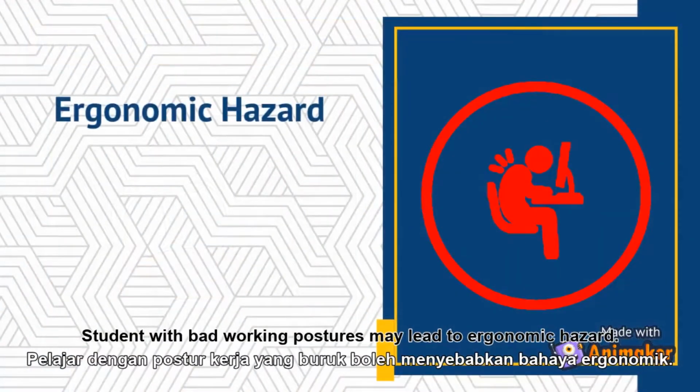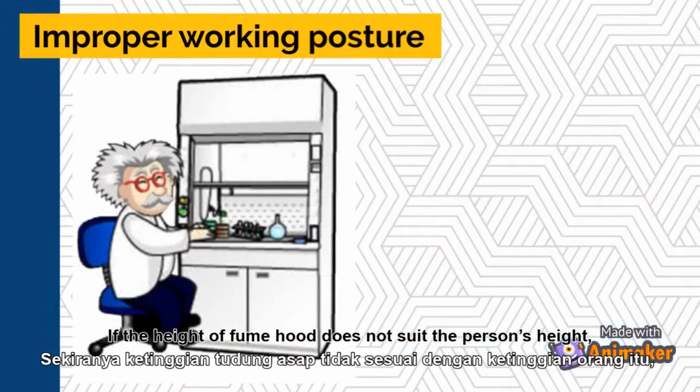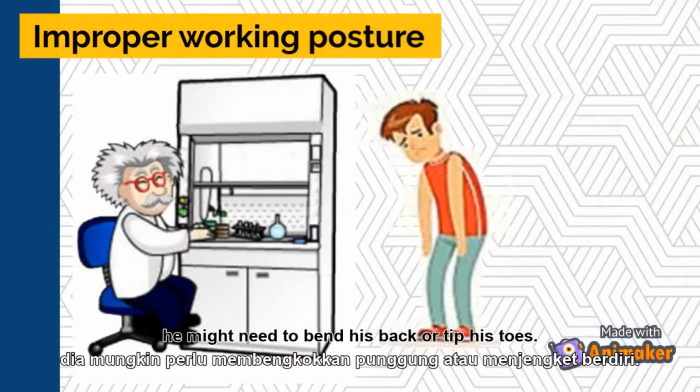Students with bad working postures may face ergonomic hazard. If the height of the fume hood does not suit the person's height, he might need to bend his back or tip his toes.